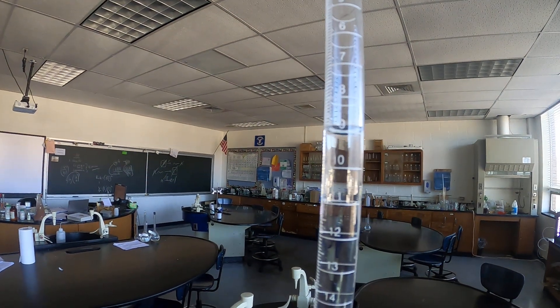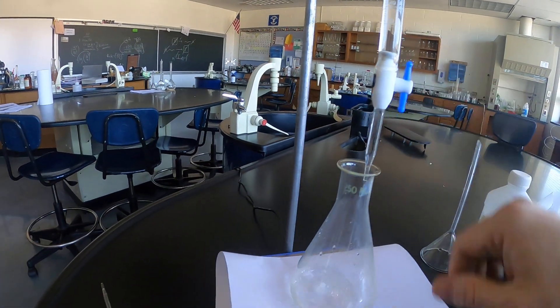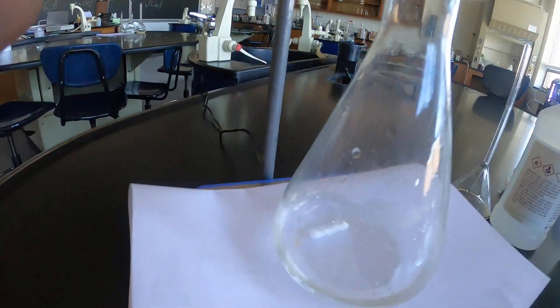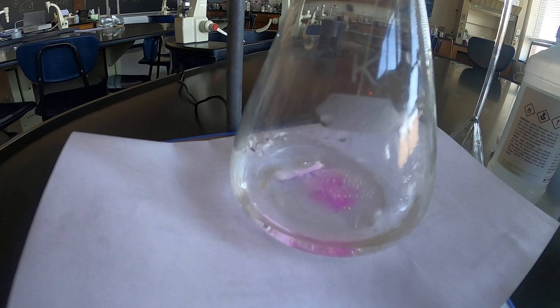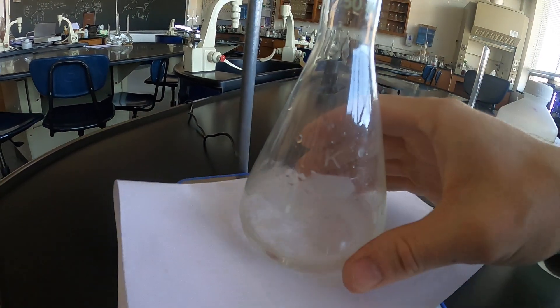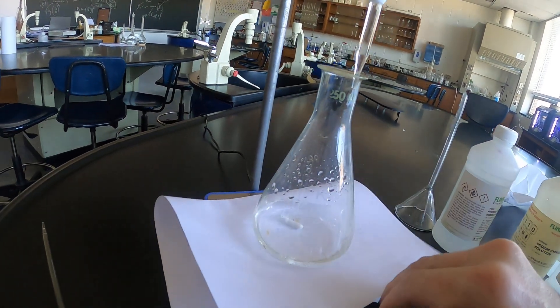About 10 ml. Now what you'll notice if I stop this for a second, turn the stir bar off, you'll notice some pink starting to build up in the flask but then when I stir it again that base is neutralized right away because there's still excess acid in my flask.